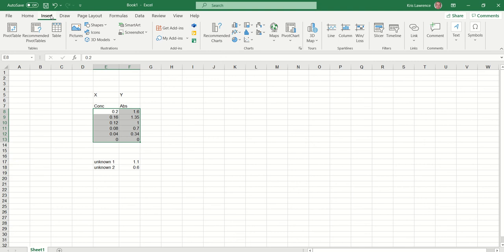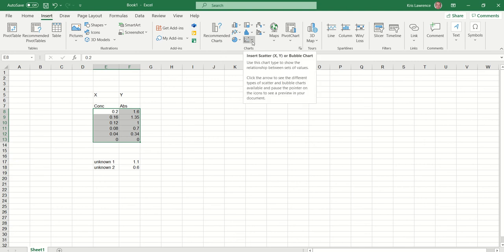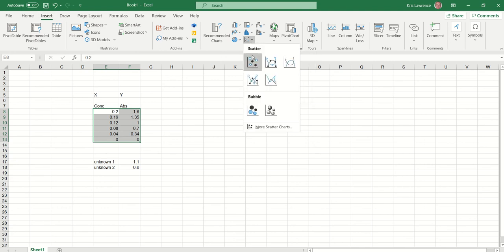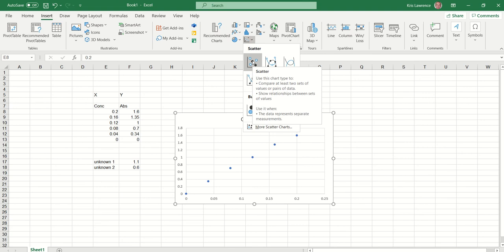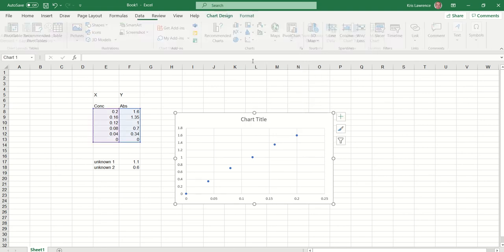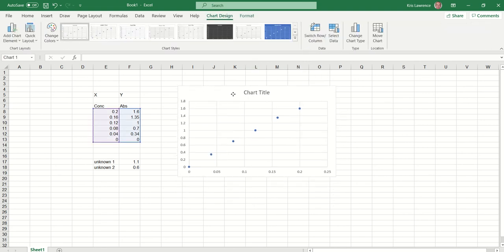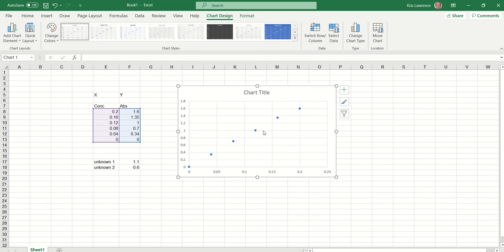You then go to Insert, across to the chart section, drop down and insert a scatter diagram. As you can see, it's already starting to look fairly complete, but we're just going to tidy it up with a few things to make it nice and neat for handing in.